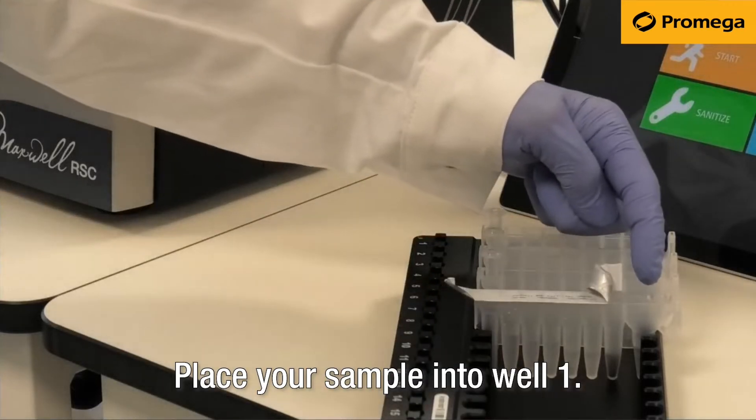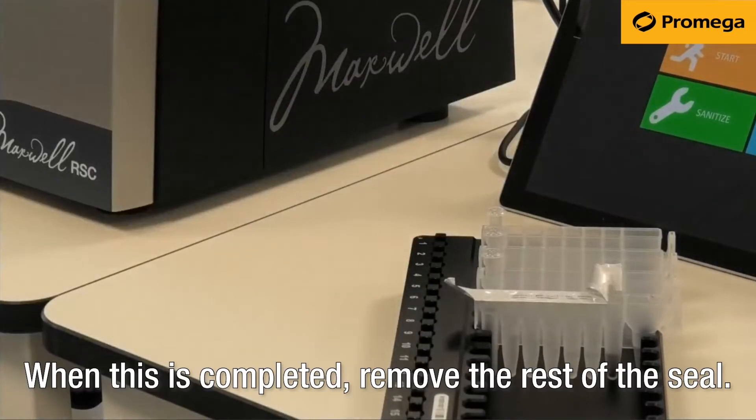Place your sample into well 1. When this is completed, remove the rest of the seal.